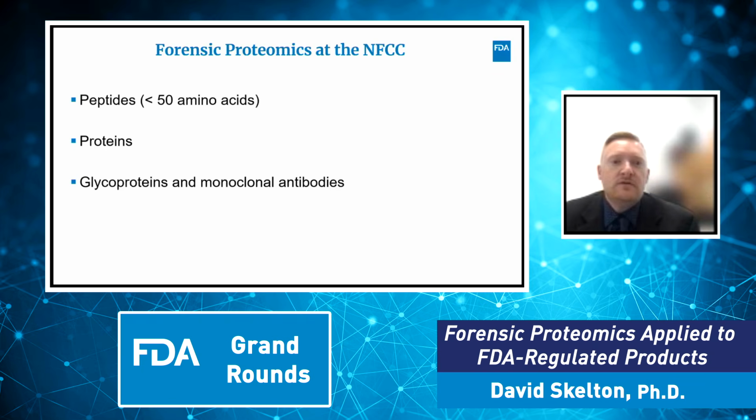So proteomics is concerned with the analysis of peptides and proteins, which are chains of amino acids. They are differentiated from each other based on how many amino acids are in that chain. Anything less than a 50 amino acid sequence is referred to as a peptide. Anything more than 50 amino acids is referred to as a protein. We routinely analyze both peptides and proteins here in the lab, as well as glycoproteins and monoclonal antibodies, which are special types of proteins with unique modifications on them, which we will discuss and show examples of later.